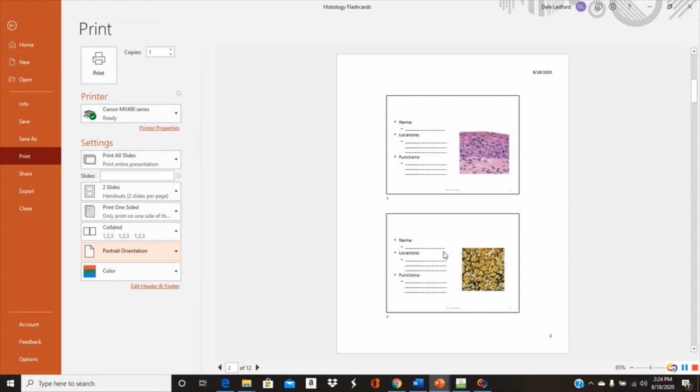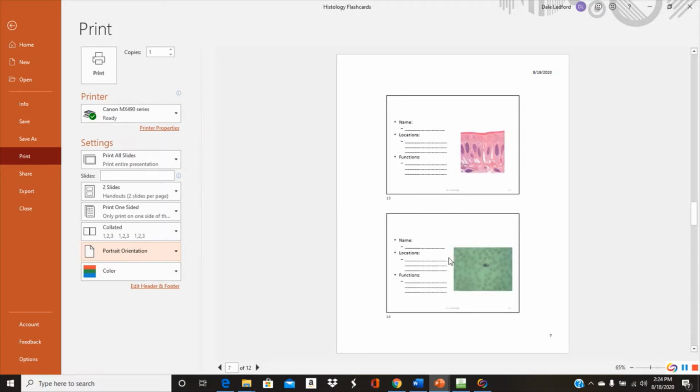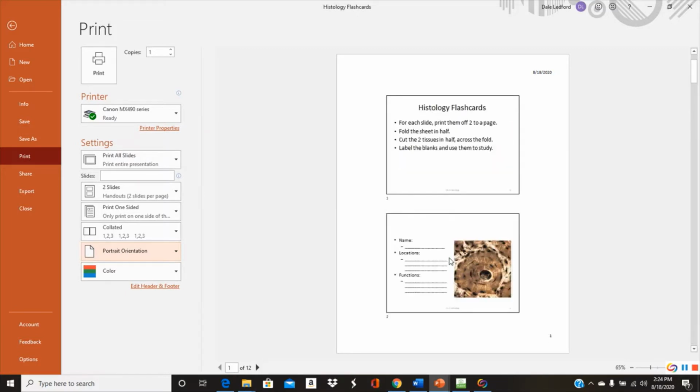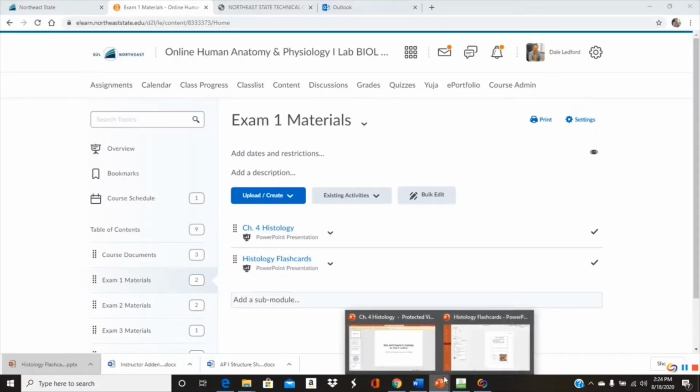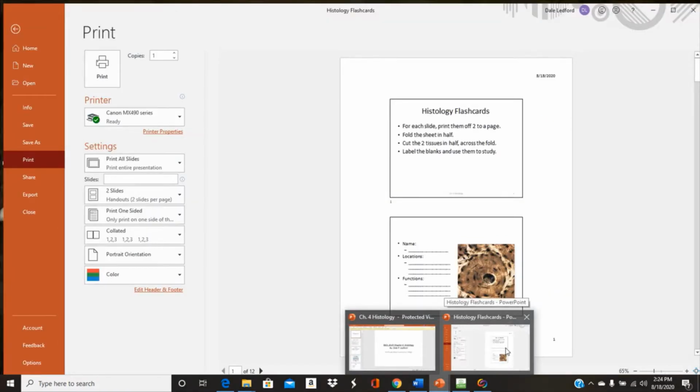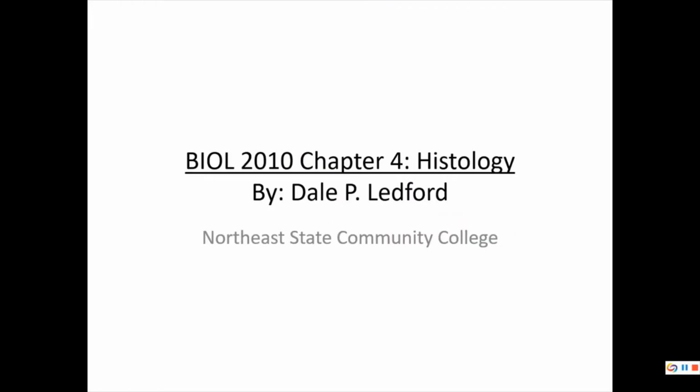And as you go through, I randomize them, but these are the exact pictures from the test. Now, they are found in my notes, so you can go through my notes and find the answers, and fill those out, but they are in a randomized order on purpose. But it walks you through a basic instruction on how to make those, and those same identical pictures are the ones used for the exam.